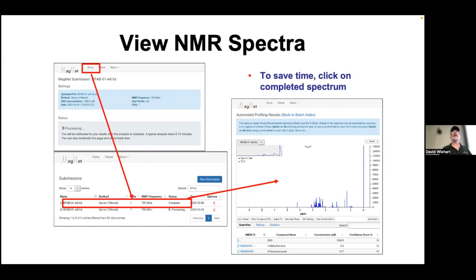You're only submitting one file, so you should see just one listed. Unless everyone's submitting at the same time, in which case you'll see all of them — make sure you know which one is yours.